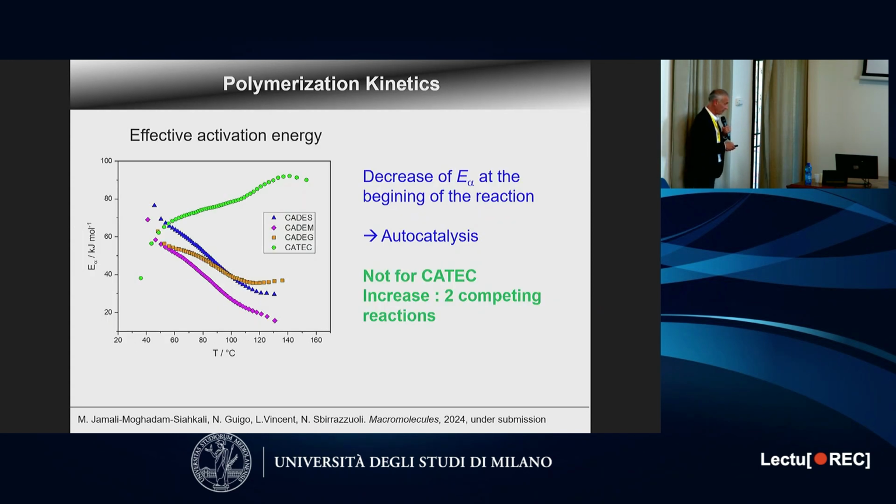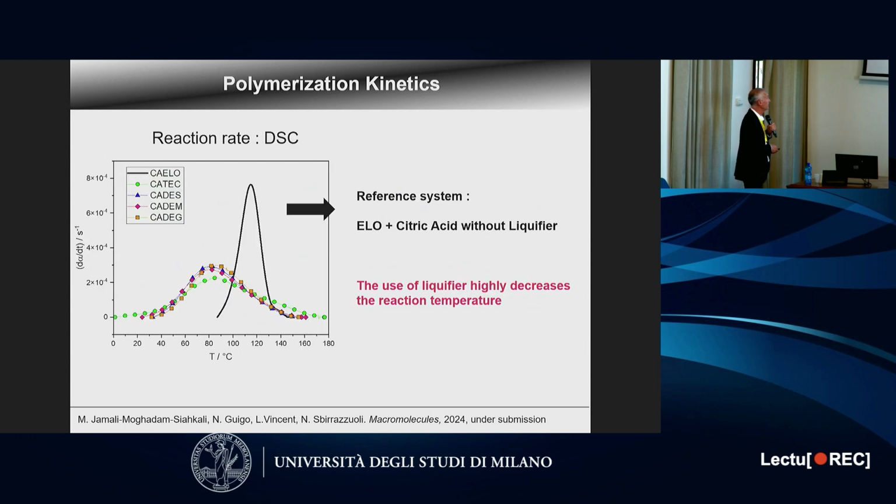Now, if I compute the activation energy, this is the dependency that I obtain. So again, we have a complex process. But what we see is that these three follow a similar trend. I mean that the activation energy decreases. And for TEC, we have something completely different. We have an increasing value. So decreasing activation energy generally is associated with an autocatalytic reaction. And so for TEC, you see that it cannot be autocatalysis, and that's why I postulated that we have, in that case, two competing reactions.